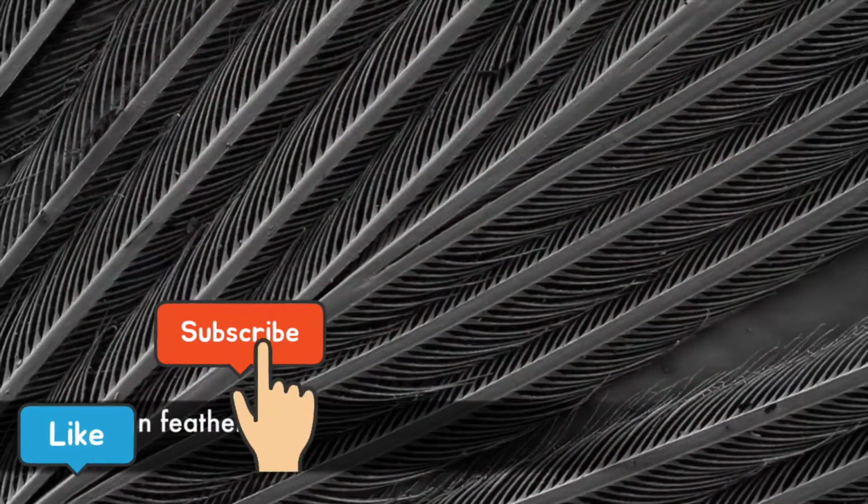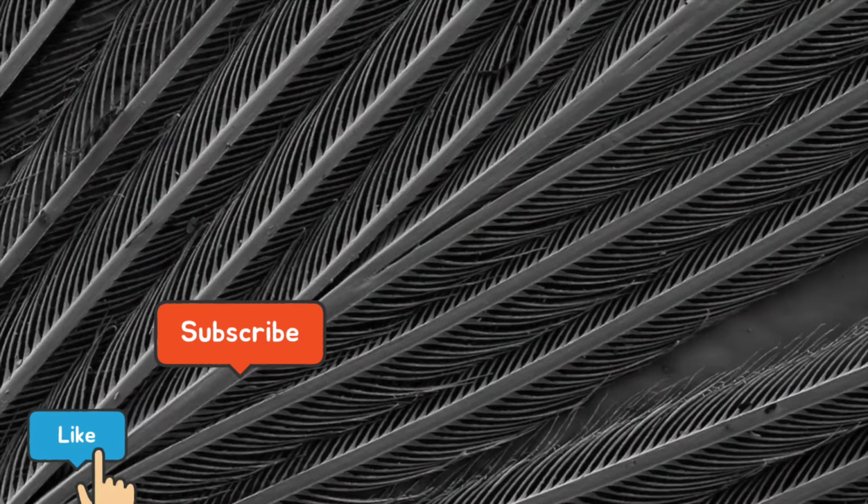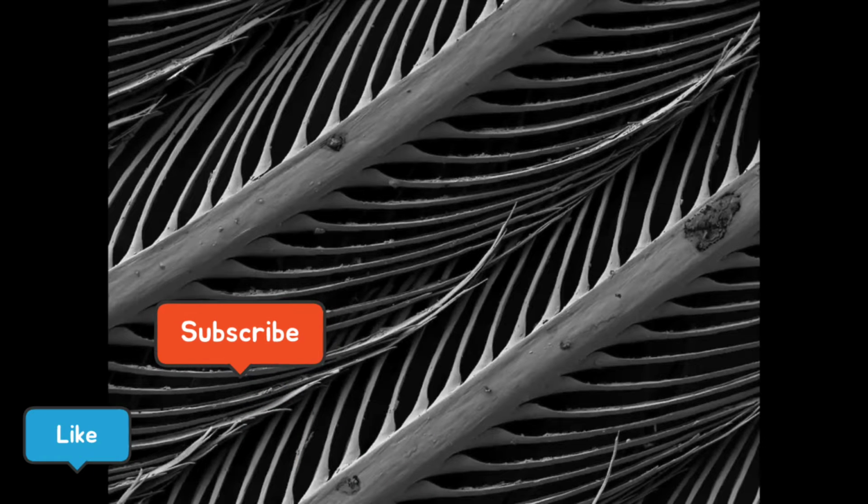Outer feather of a penguin. Penguin feathers are short, overlapping, and densely packed. The outer part of the feather is waterproof, while the inner down section traps an insulating layer of air, keeping the penguin warm in sometimes freezing water.